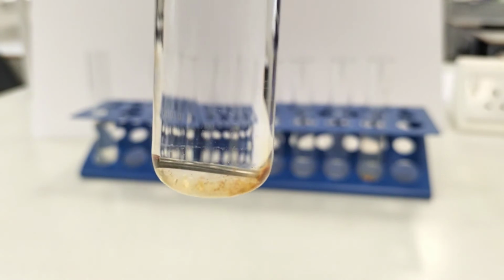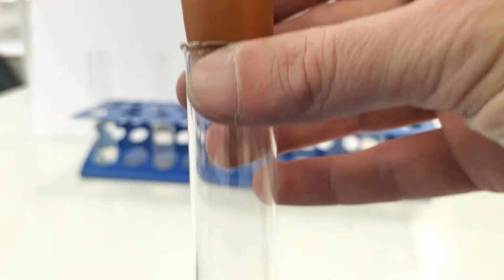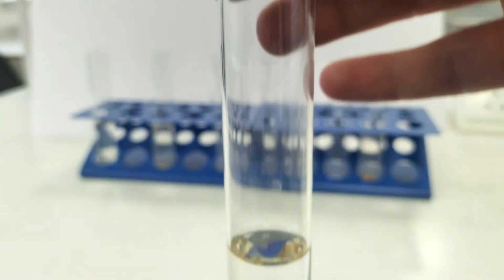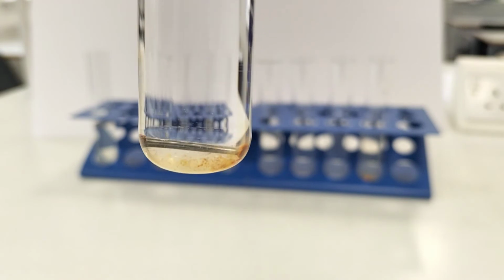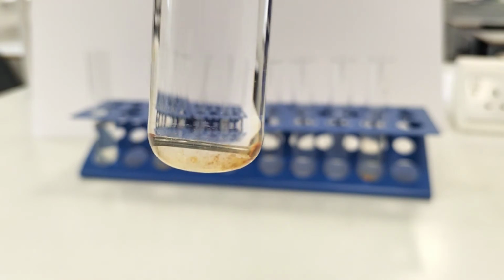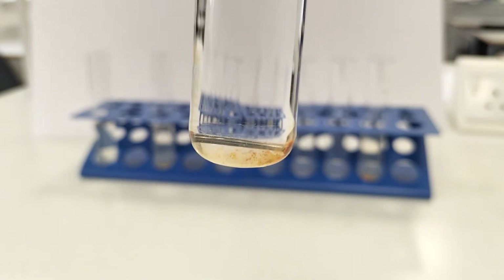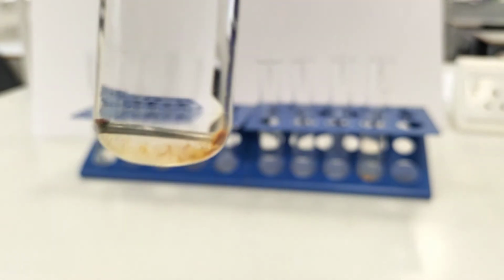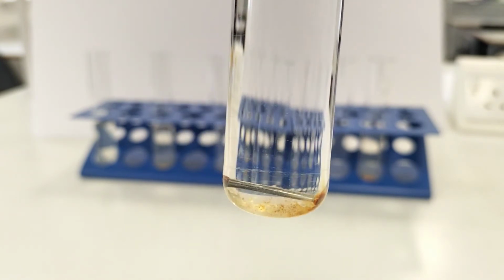Experiment 3 is interesting. Now this was the experiment where we had boiling water around the iron nail, and we also sealed the experiment with a bung to stop any fresh air getting in. And the extent of rusting is much, much lower than the first 2 experiments. It's a bit around the ends of the nail, but compared to the salt water and the normal temperature water, we have much less rusting going on. So why would using boiling water massively reduce the rate of rusting over that period of time?